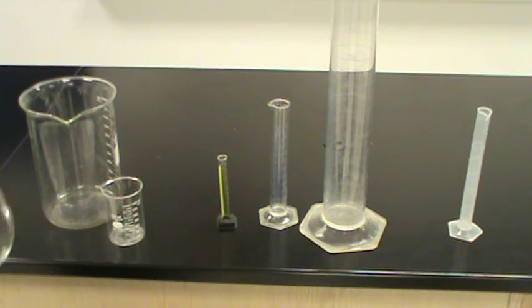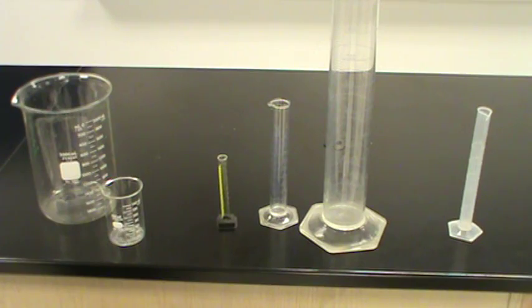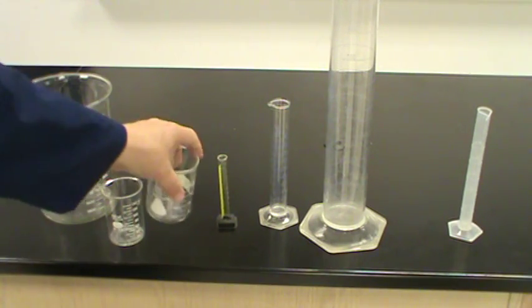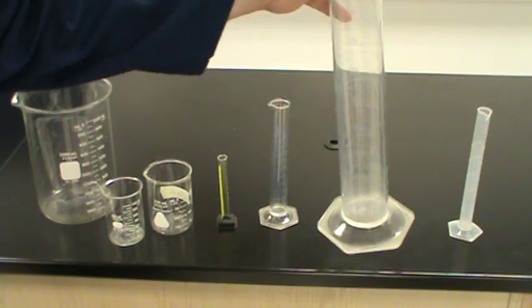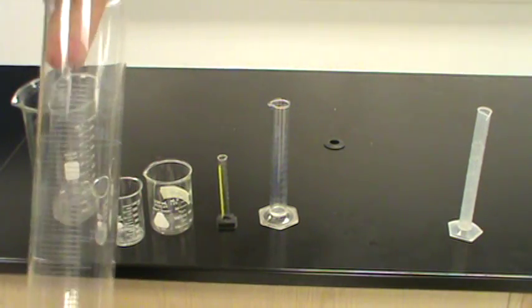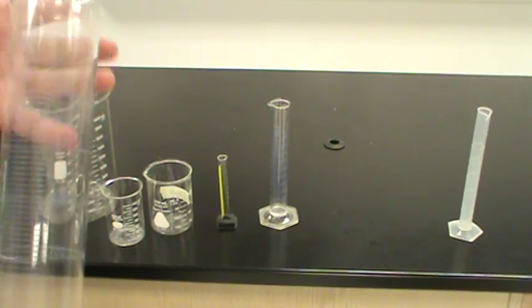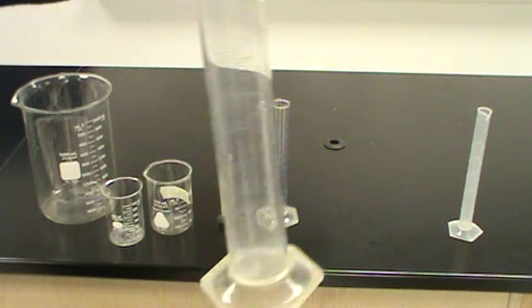For most science and most of the things that we've been looking at, that room temperature is approximately 70 degrees, or as it says right here on this large graduated cylinder, I don't know if you can see it or not, but it says right there that it's 20 degrees Celsius, 60 something degrees Fahrenheit.